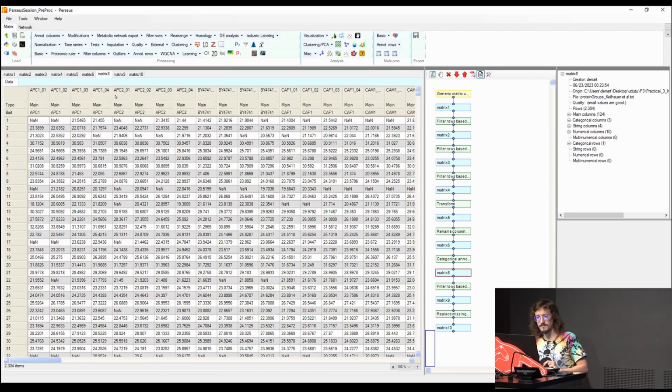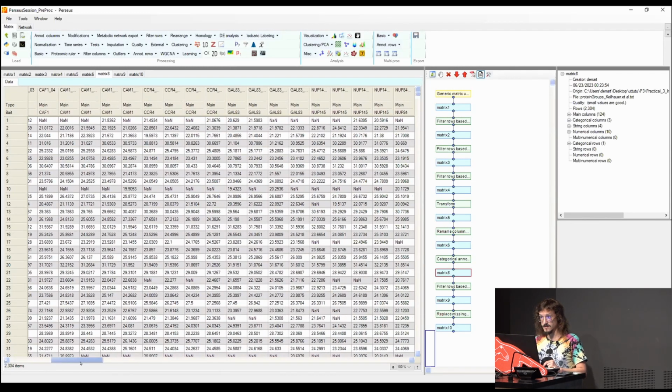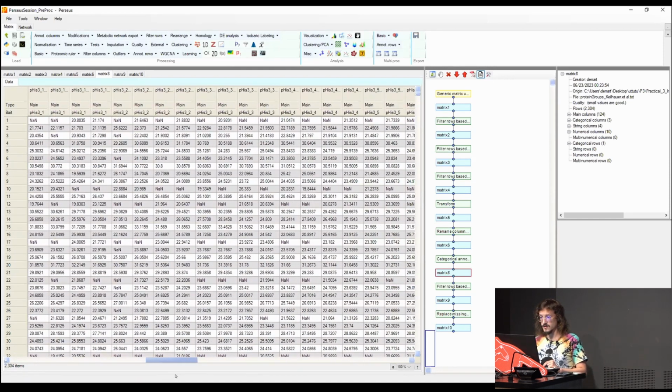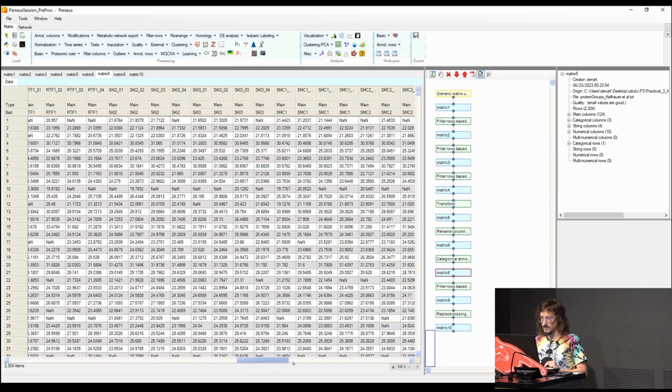So we have here the different baits. There are 4 replicates for every bait. So one is APC1, APC2. Here the baits are, if you remember from before, those specific proteins that have been tagged with GFP in order to be selected. We have here then all the controls. They prepared several different controls with several different histone proteins marked with the GFP, and each one of them also has 4 replicates. Yeah, you have here all the LFQ values for all these experiments.